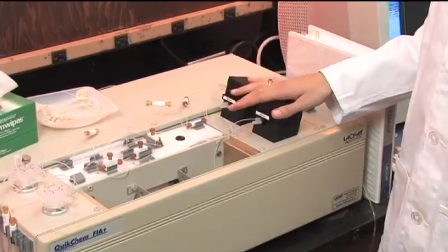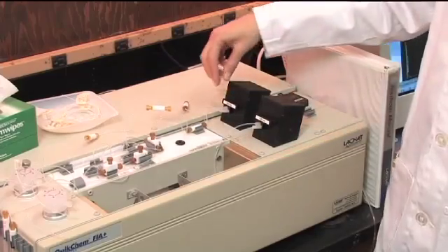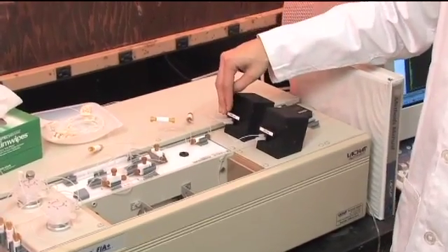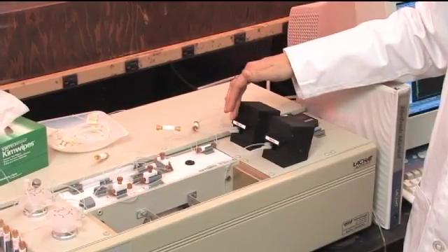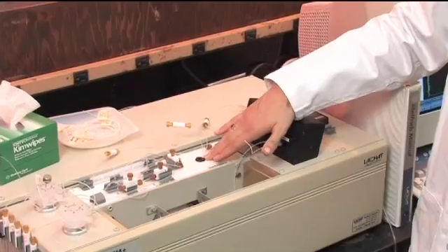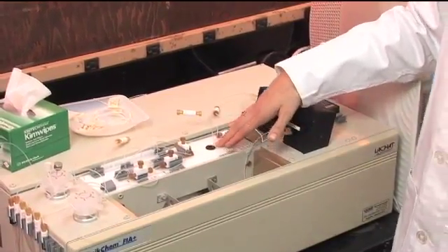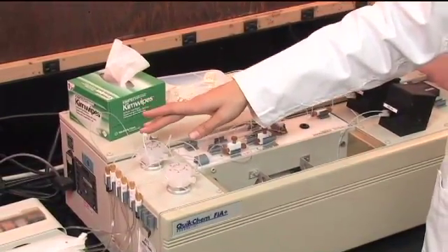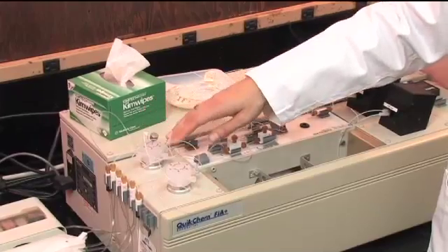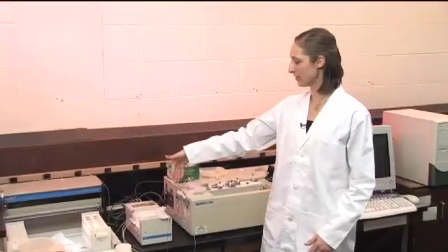I've already hooked up the phosphate manifold, and the things that I had to change to match the method were the filter, so that it can pick up the color absorption for this particular method. I've hooked it up to a heater, which is necessary for color development in this method. I've also changed the sample loop to the appropriate size and hooked up the valve to the manifold. All of these tubes are ready to go into the reagents.